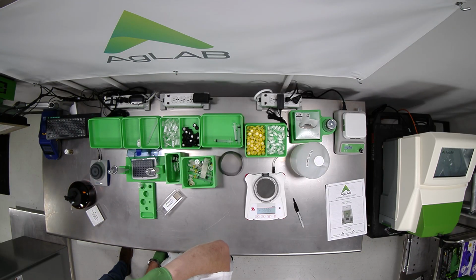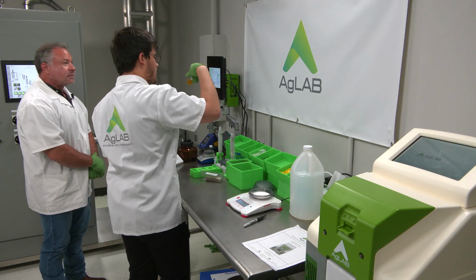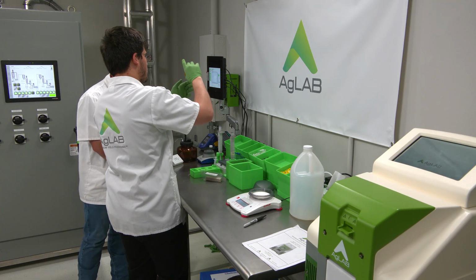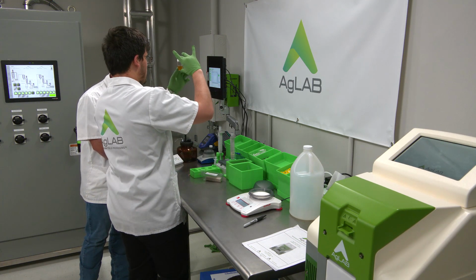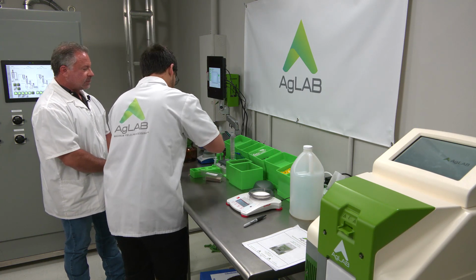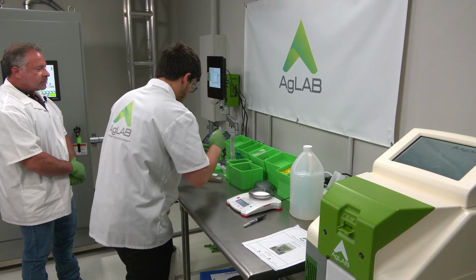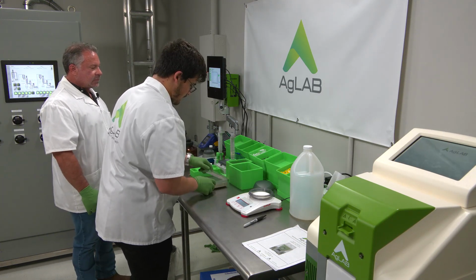And this looks much better. There we go. Everything looks like it went in solution. And obviously you can tell stage 2 residue really gets cloudy, and you can definitely see that you have sample in there. Heads material, a lot of time it'll look like a semi-clear solvent.